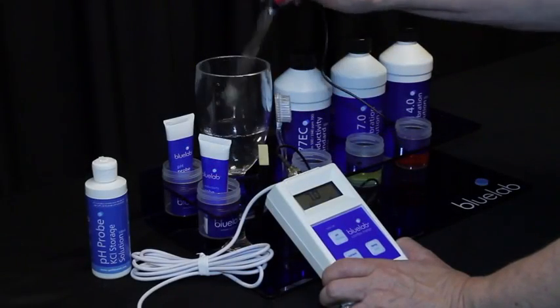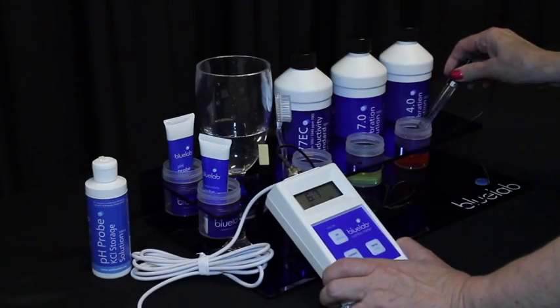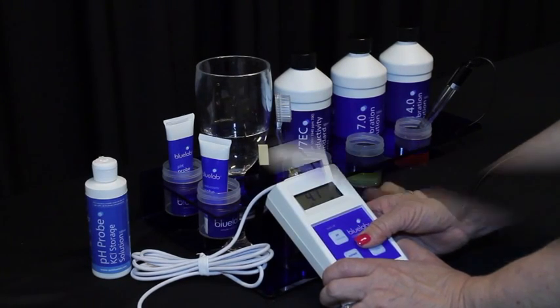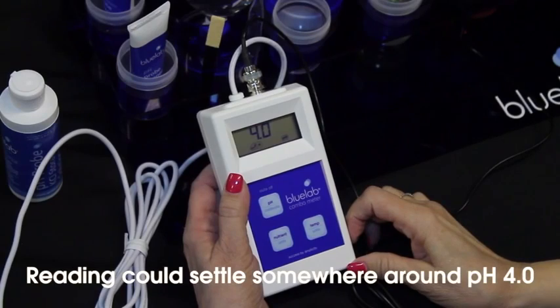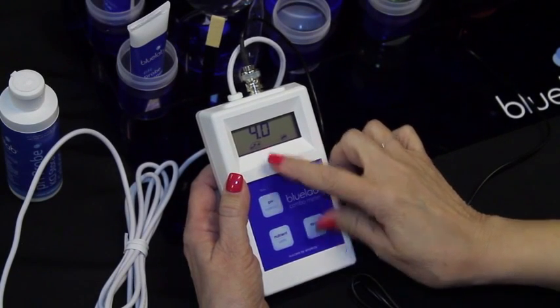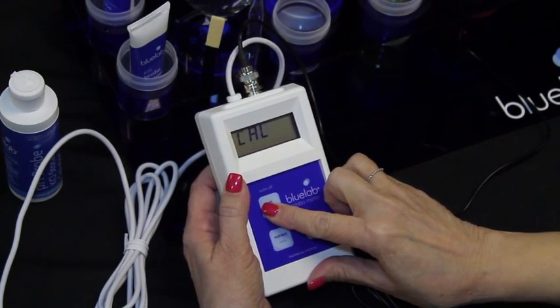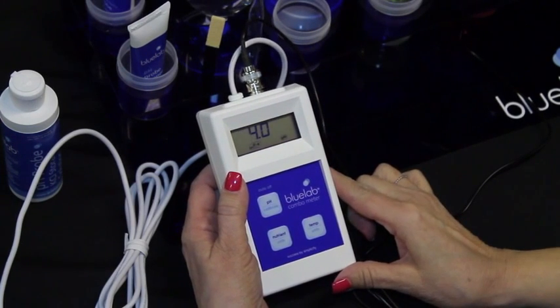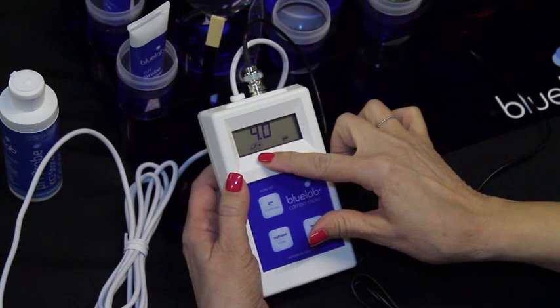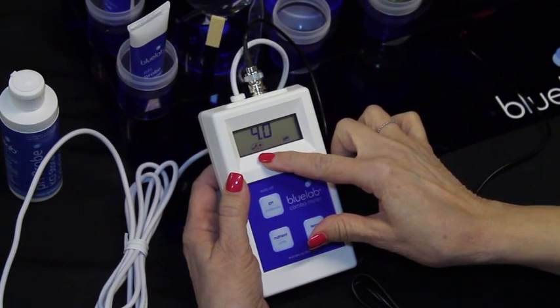Rinse the probe tip in clean tap water and place it in pH 4.0 solution. Be patient and wait for the reading to stop — it may take a few minutes. Press and hold the pH button until CAL appears on the screen, then release the button. You have successfully calibrated when you see both calibration indicators on the screen.